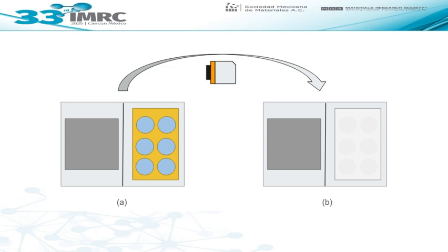This camera translates the information into infrared information, a 16-bit resolution image in grayscale, as we show in the right part of the slide, marked with the letter B. Now, the temperature of our sample and the temperature of our surroundings are pretty similar, so our camera throws a very low contrast image.